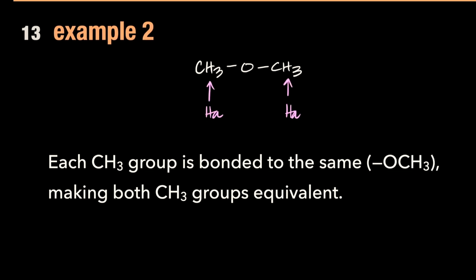So if I were to see the graph of this, it'll only have 1 peak, because the number of peaks is determined by the number of different proton environments. Here there is only one environment. So when its graph is seen, it will have only 1 peak, and what will its height be? 6, because there are 6 hydrogens in it.